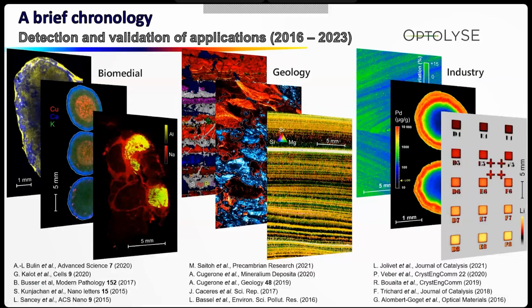And from this moment, we started to attract the attention of many groups in preclinical evaluation, like Harvard, Fraunhofer Institutes, many groups in France. And we had the chance to participate in very high-level papers on nanoparticles. In fact, the biologists really appreciated the capability of this imaging technique to screen all the organs without any labeling. And so we developed some biomedical applications I will show more later.